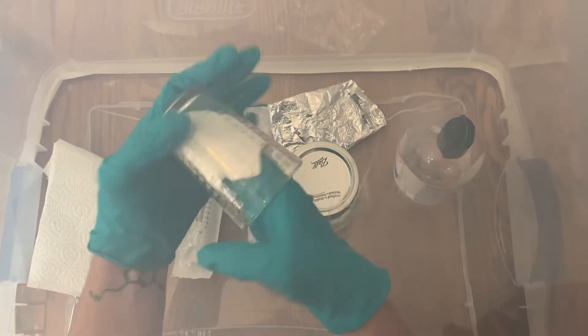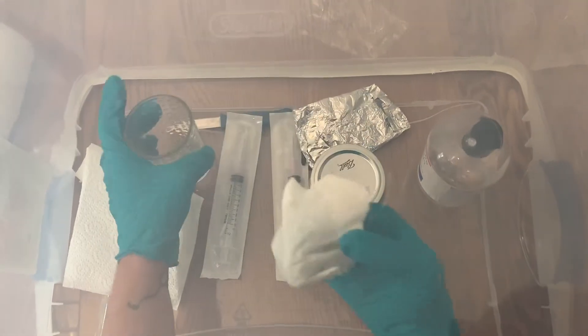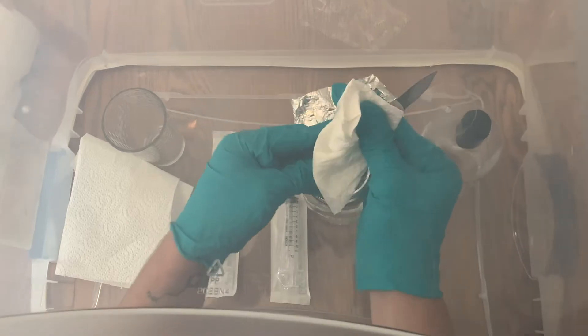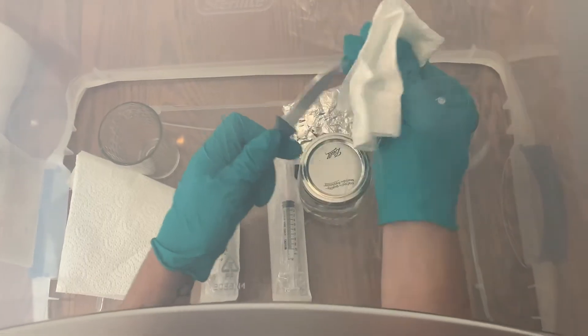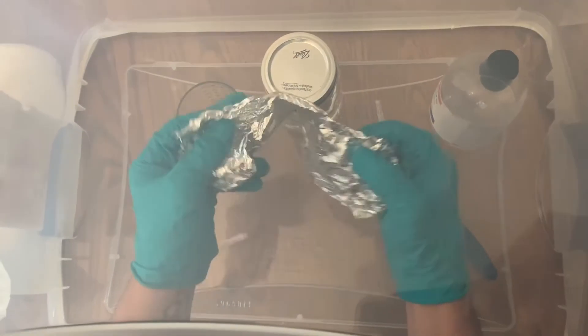This is fairly easy and you only need a few things: a small shot glass or a small cup, a sterile knife, isopropyl alcohol, paper towels, a spore print, sterilized water, and a sterilized syringe and needle.